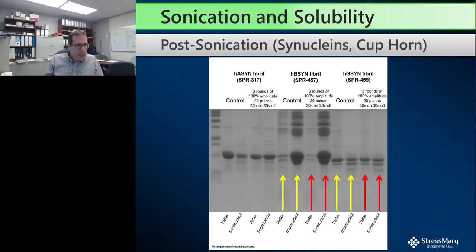However, beta-synuclein appears to already be in solution, which is something which we had not realized. When making beta-synuclein fibrils, this is a protein that does not fibrilize readily at all. You can try to fibrilize it even for a year without success.